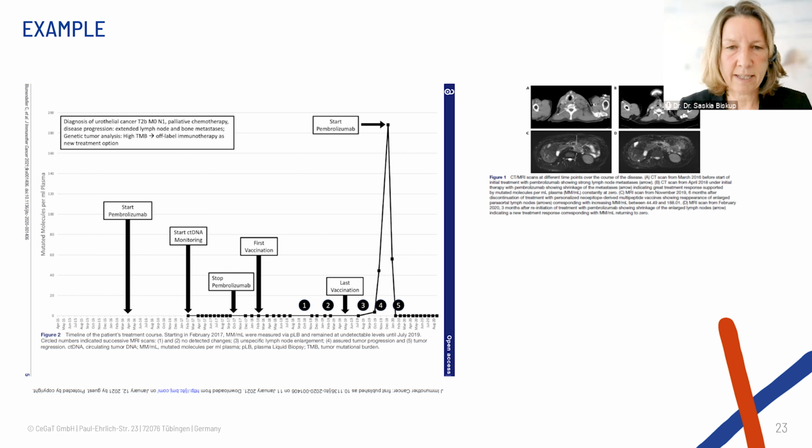We started the vaccinations, and then unfortunately he also got side effects, an allergic reaction, which indicated that we generated a very strong T-cell response. We had to stop the vaccine as well, but we still monitored the liquid biopsy by the digital droplet PCR. And then you see on the figure that the droplets started to increase. We had 3 droplets, then 10, then 144. We went to the clinician and said, look, you have to do imaging. There's something going on, we are sure.